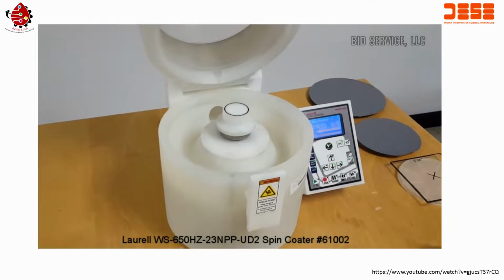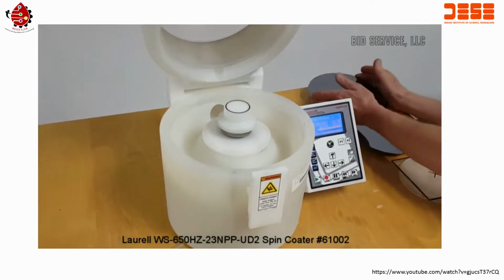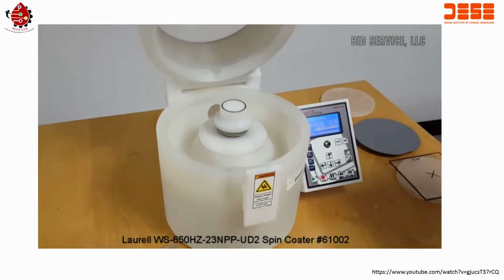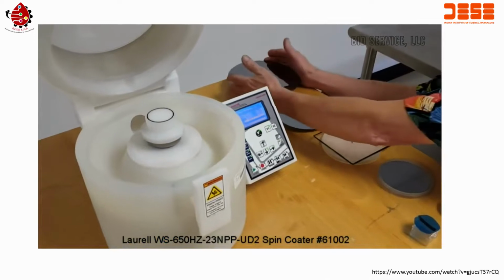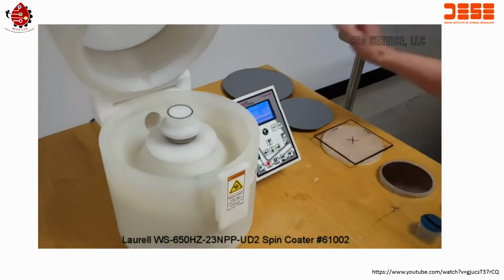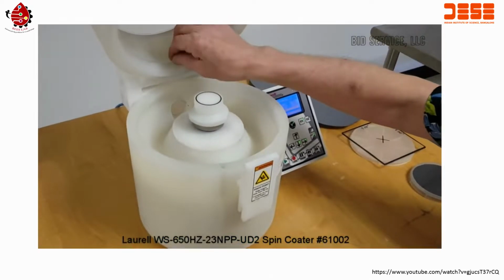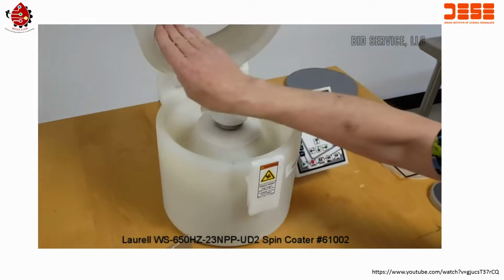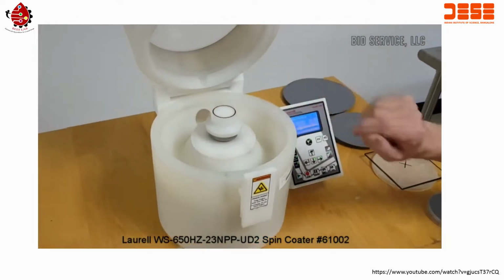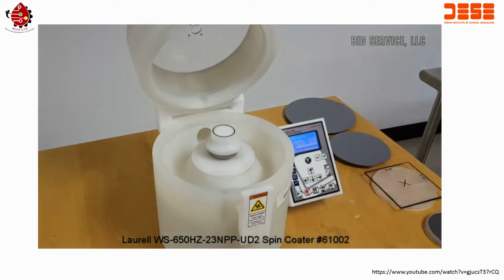Now, the spin coater has the capability of actually being able to spin a full 200 millimeter or 8-inch wafer. However, it is to be noted that in order to do so, you would have to remove the top and take off this plastic splash guard, because that just isn't enough room for it. But it actually has the capability of spinning an 8-inch wafer.